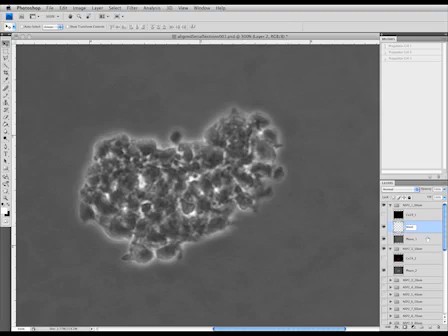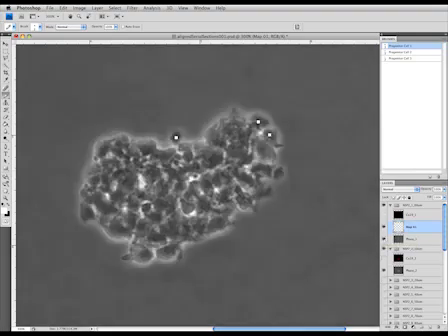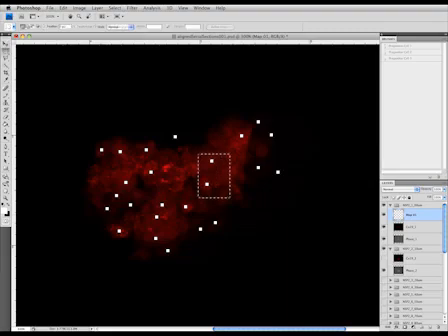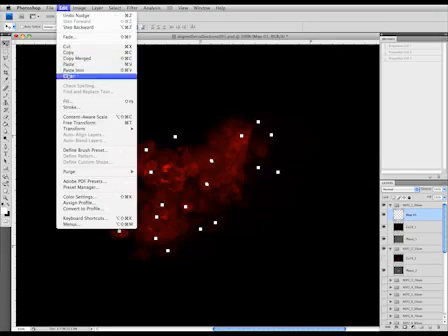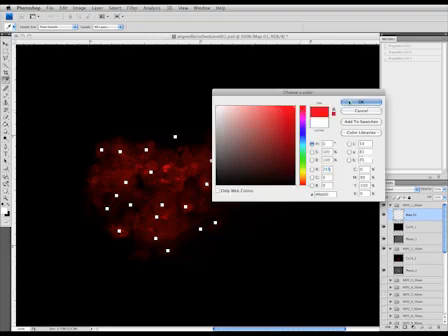pencil stroke. Use a separate layer within the section folder with which to build your maps. Toggle between sections to locate the cell's position, ensuring that cells on more than one section are properly denoted. With the CX29 layer turned on, select the cells that fall in the regions where CX29 is positively expressed. Choose the Fill command from the Edit tab of Photoshop's main menu bar and change the white strokes to red.